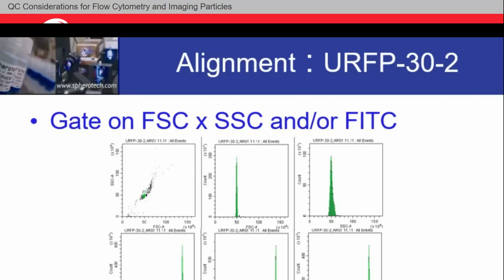And I just gave a standard concert of some regular channels. I like to look always at different lasers. So this second row, first one on the left, B525 FITC. That B, I've labeled it for my laser, B blue, 525. Middle one, Y, yellow laser, 585 PE. Third one, red, 660 APC. That's a fantastic place to start. That's where most flow cytometers did start.